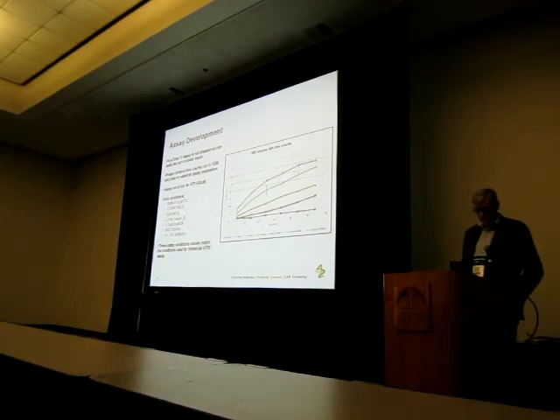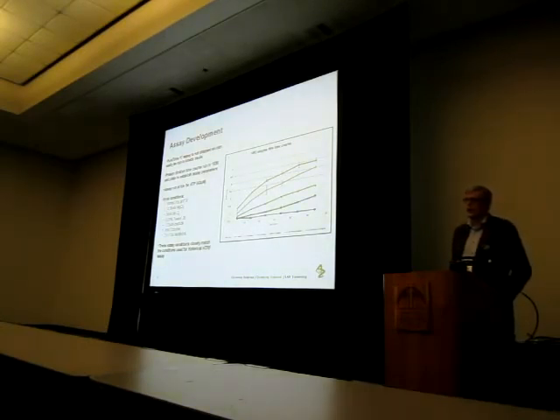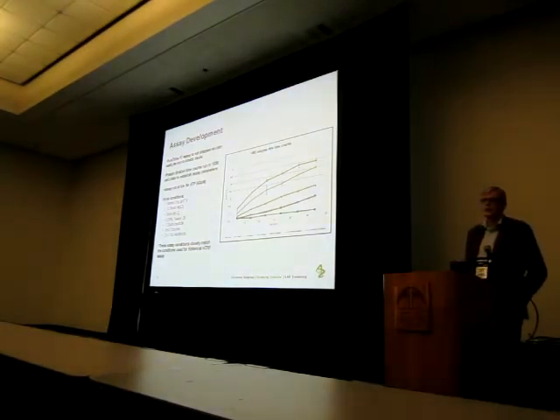In terms of the amount of enzyme going in, we were running at roughly 1 nanomolar enzyme. It was the same enzyme stock that we purchased from Millipore, so it's commercially available enzyme. It's the same enzyme we would use in the HTRF assay. In terms of the buffer mix, that's absolutely identical to the HTRF assay that we run. So in essence, the bit that we validated here really is to understand what titer of the SARC enzyme we need to put into the assay. When we went back and checked against what we were running in the HTRF assay, it turned out we were in exactly the same ballpark. So we had confidence the assay was going to run.